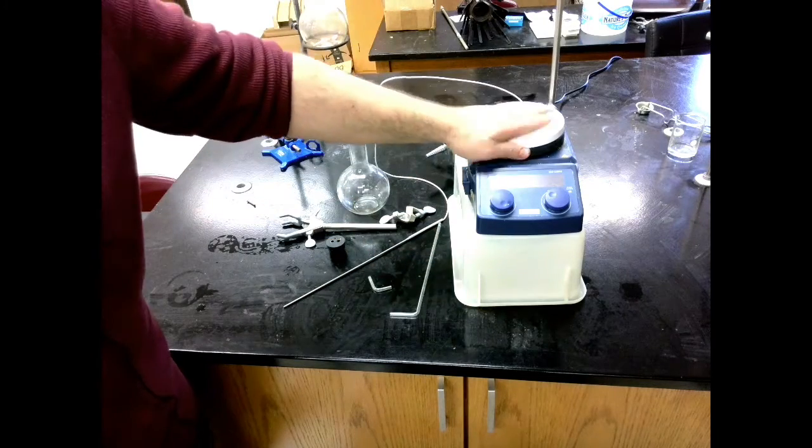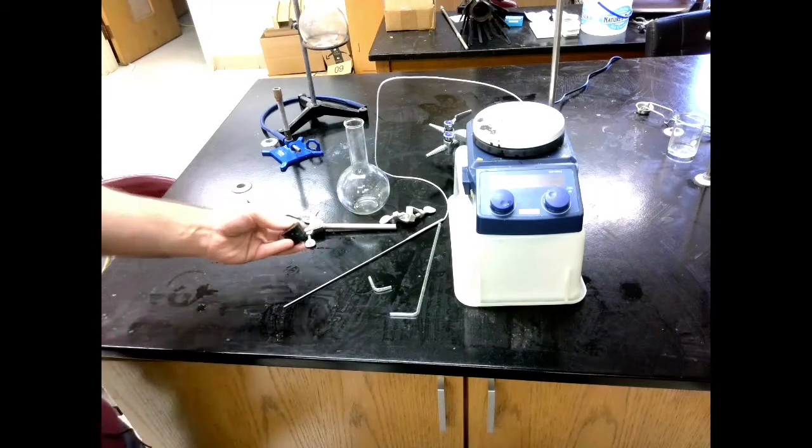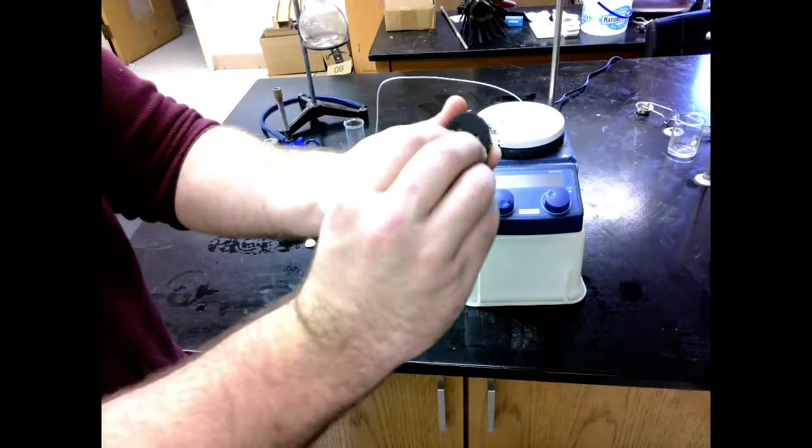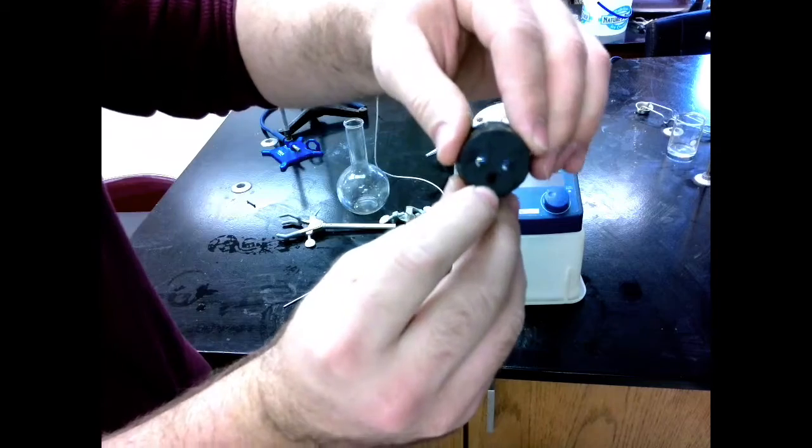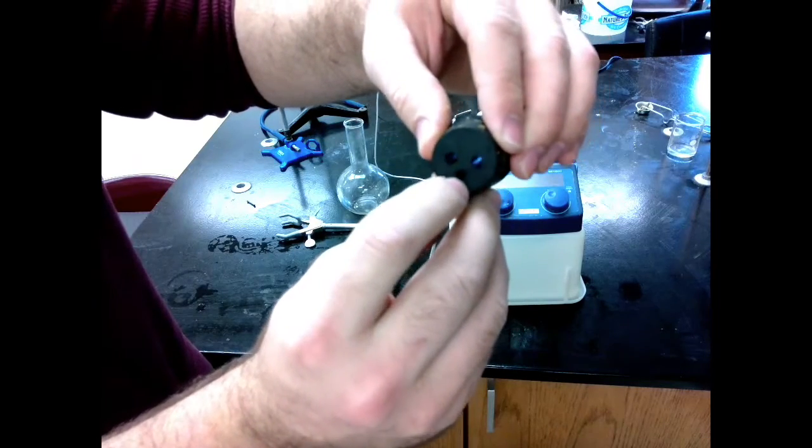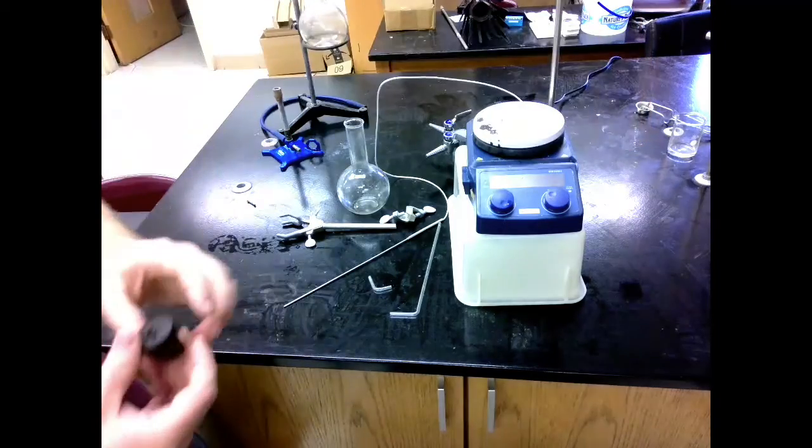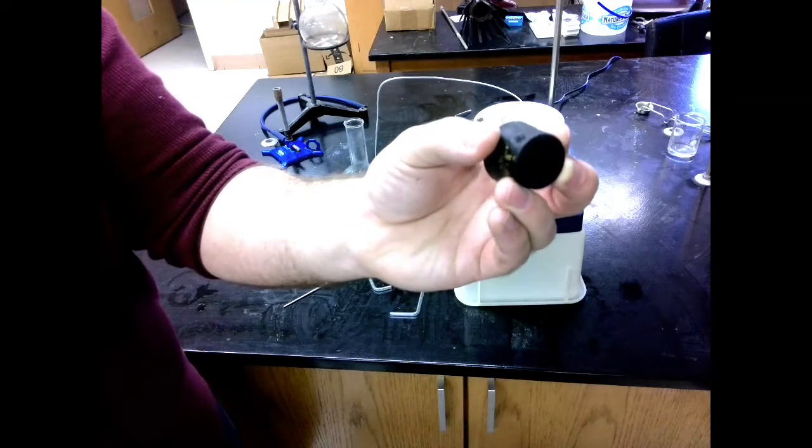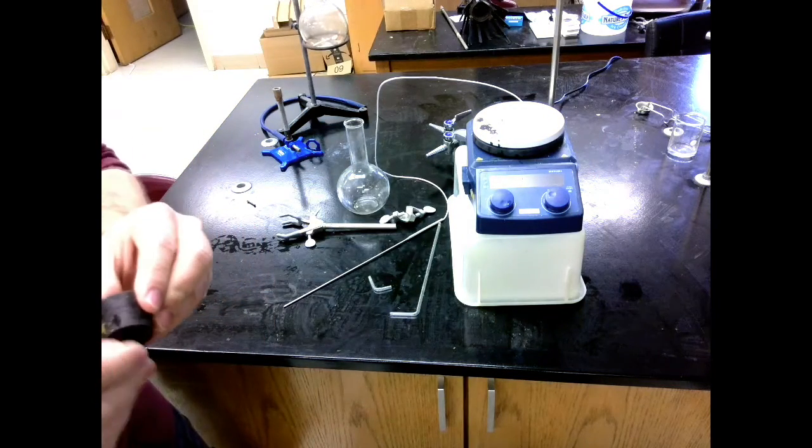This rubber stopper is a little different than the other one. You can see it has two holes here, and then it's got a third hole that's been cut into it to make room for our temperature probe. If you can't find one of these that has this third line cut in it, let me know and I will cut one for you. Just continue setting up the rest of the lab while you're waiting for me.